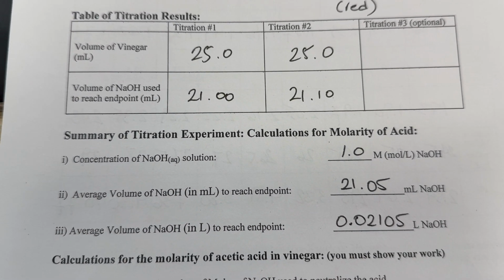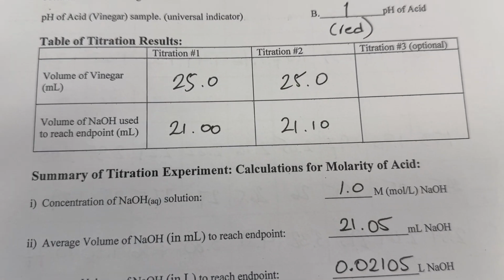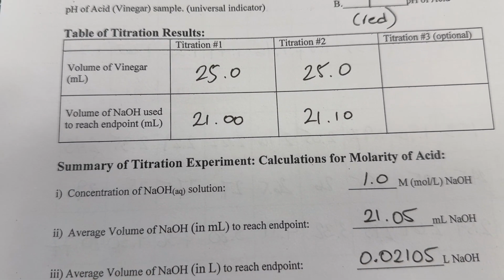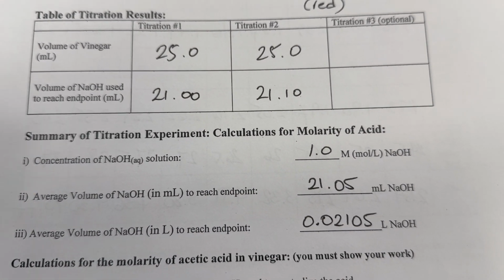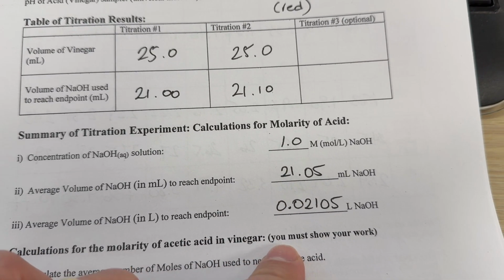Our 2 volumes of NaOH were 21.0 and 21.10. So with that, we're going to do an average of 21.05. The concentration of the NaOH was 1 molar.